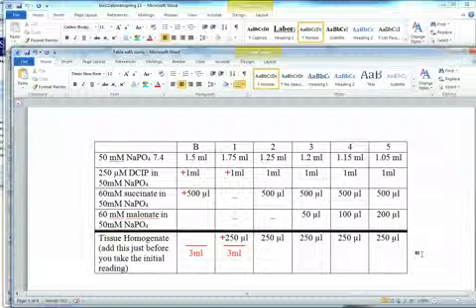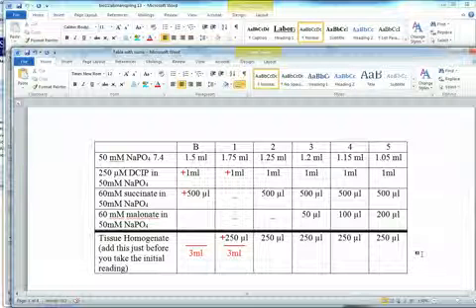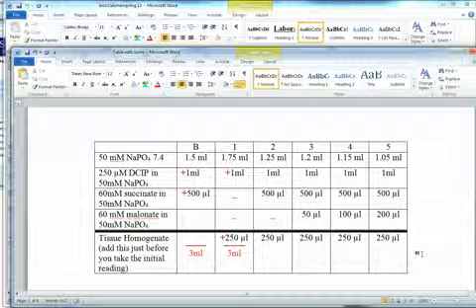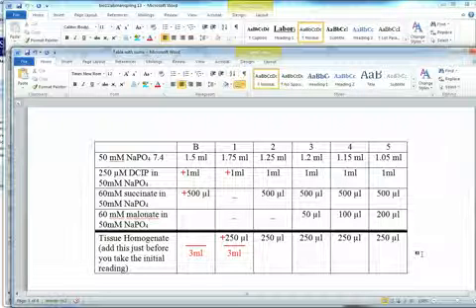But when you write methods for this manuscript, and really that's what your lab report is, it's a scientific manuscript, you write it so the focus is not on exactly how the reaction fit in your cuvettes, but on the relationship between the molecules. Now, I showed you in lab how we used the M1V1 equals M2V2 equation to show the final concentration of succinate in the reaction was 10 millimolar.